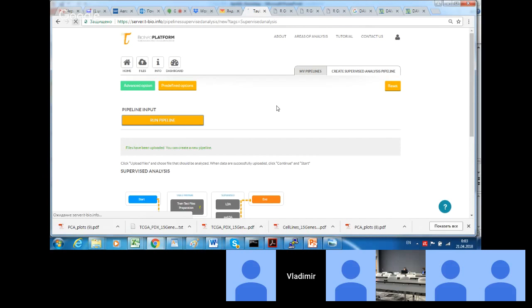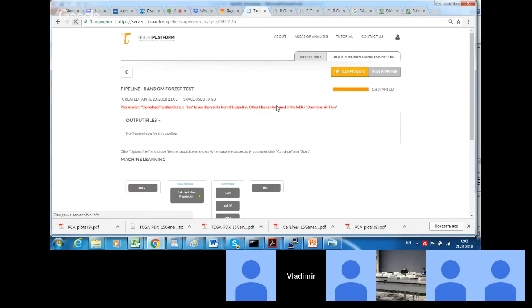While pipelines are running, let me just summarize the main points of our discussion we had today. First, in many cases, no coding skills, no statistical background, and no mathematical background is required for standard processing of RNA sequencing data, even starting from raw data.